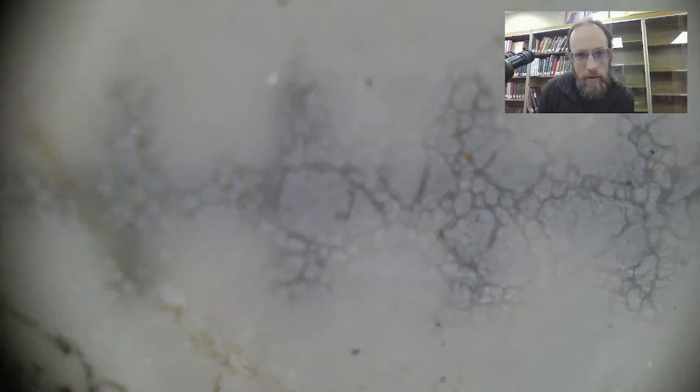Interesting. So yeah, that does look like more than just a mineral pattern. Even if there is a mineral pattern in there, it certainly looks like there's, I don't know, are there little vascular bundles? Are there little starchy globs? Am I just reading too far into the tea leaves?